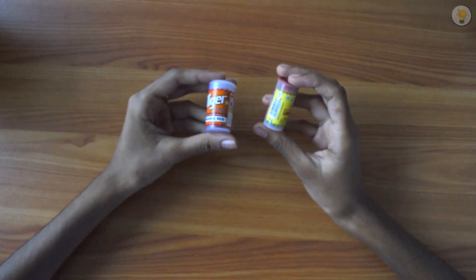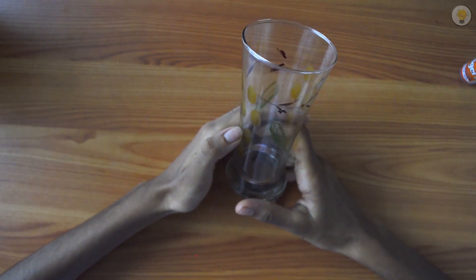We also need Synthetic Food Color and a glass. This experiment uses a glass container. We are using a 120ml Hydrogen Peroxide Solution.